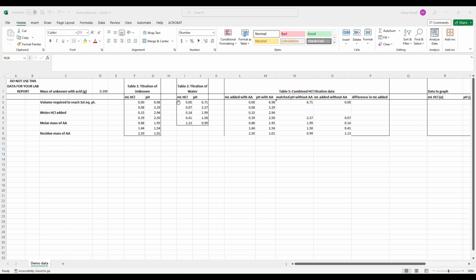So we just calculated the average of mLs added around this gap. We had a 0 and a 0.05, so we calculated the average, 0.025. If you have a gap of 1, calculating the average is a pretty good shortcut, but here we have a gap of 2. So how can we fill that in?